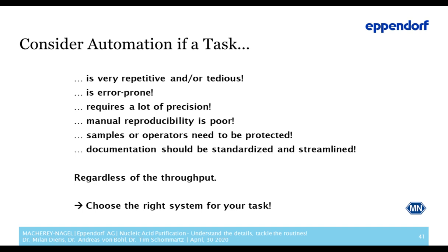So choose the right system for your task. Don't always go for the biggest available option. Look at what is really helping you. So you are smart working in the lab, so it's good to have smart automation at your side helping you to do your daily work.